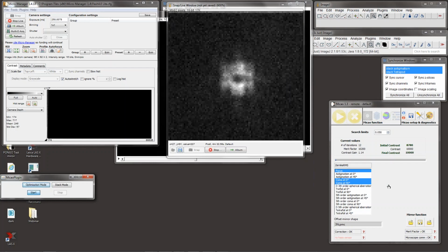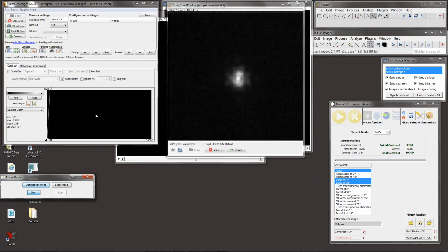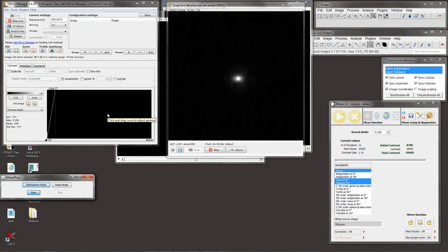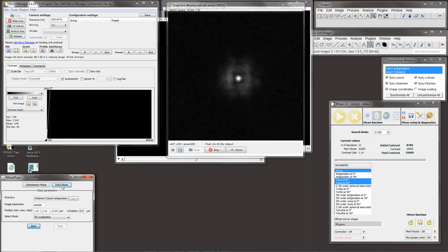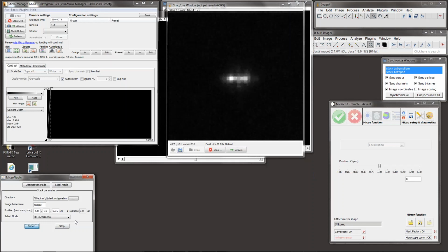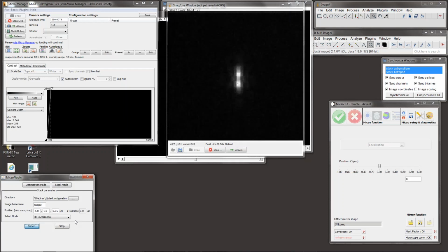Now it's symmetrical and intensity is very low now. So this is the feature of a corrected PSF. You see that intensity drops very quickly. So if I apply astigmatism now, you see that it's not distorted as much. Let's say we probably could do even better, but at least it's symmetrically split on both sides. So the point spread function becomes symmetrical.